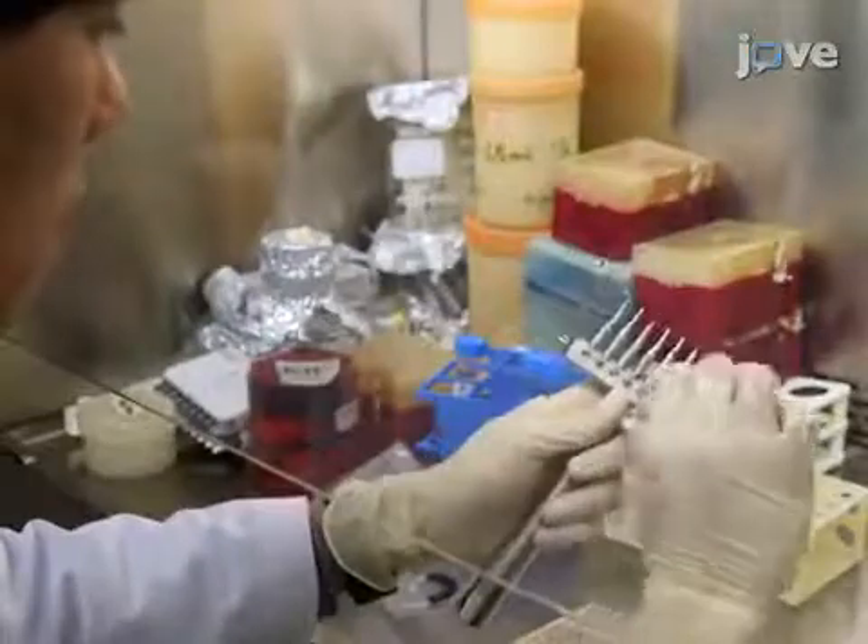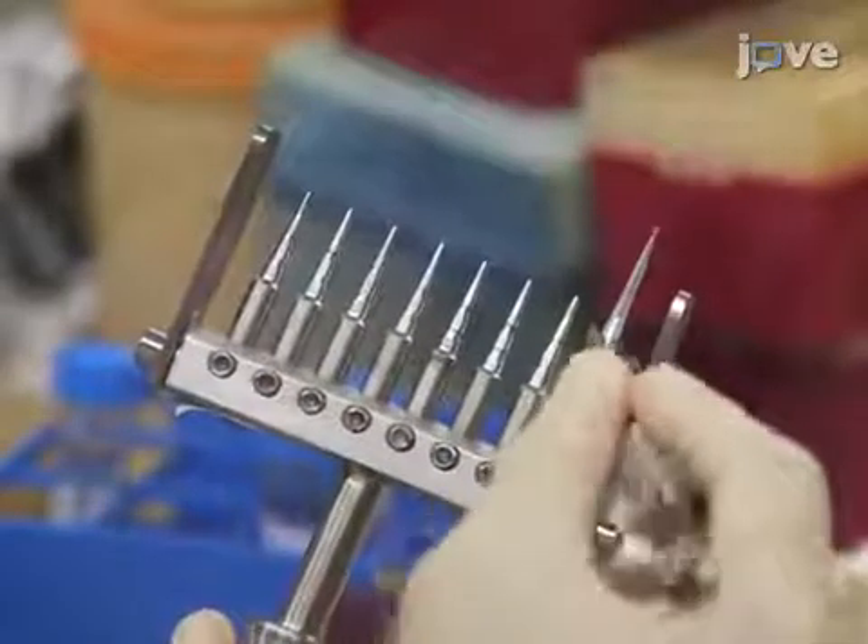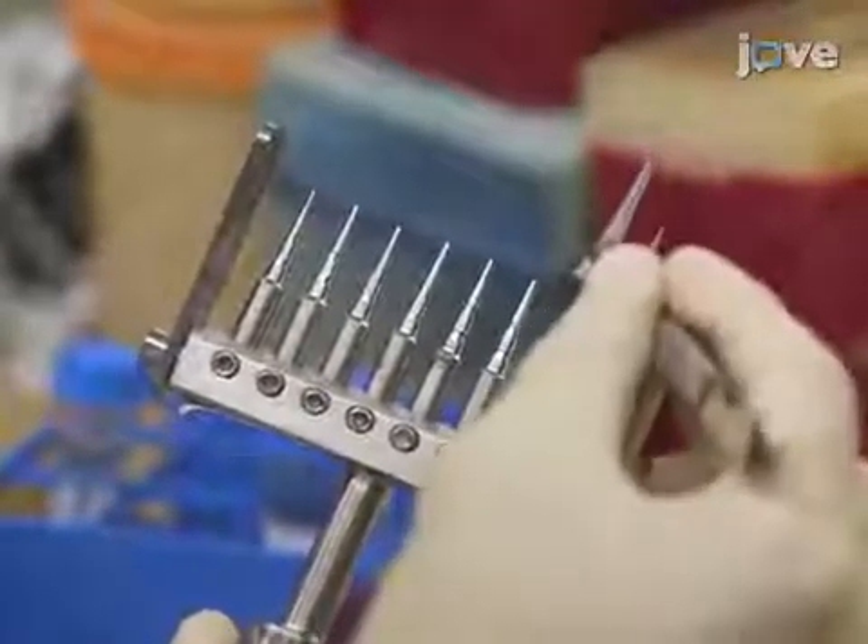To begin the experiment, prepare the pin holder by fixing the wounding pins at equal distances. Hold the pipette tips and move the adjustable wounding pins up and down to adjust the tip height.